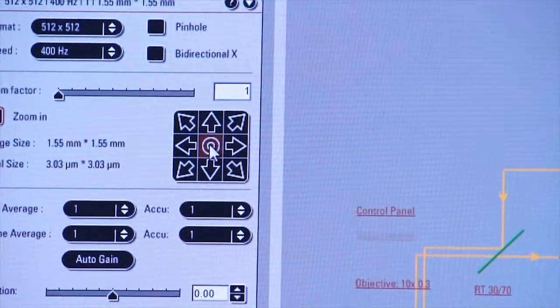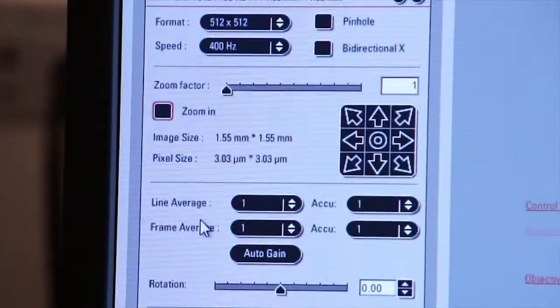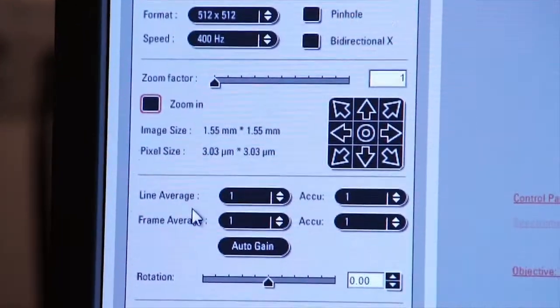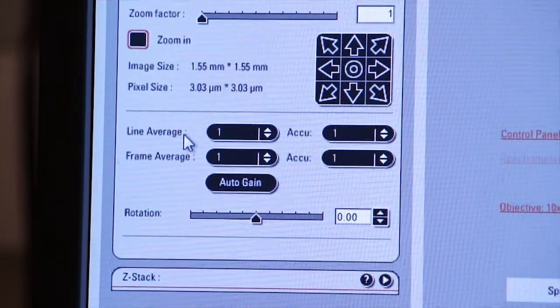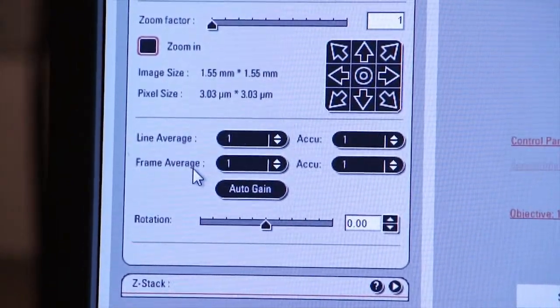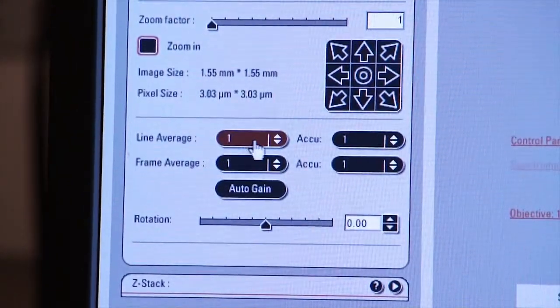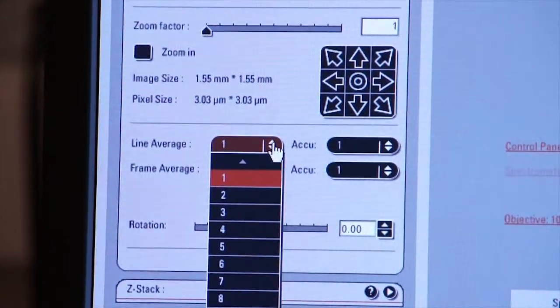Finally, on the left-hand side bottom of this tab, you'll see that we can do a line average and a frame average. This allows you to reduce noise in your image, and we'll come back to this in a second.